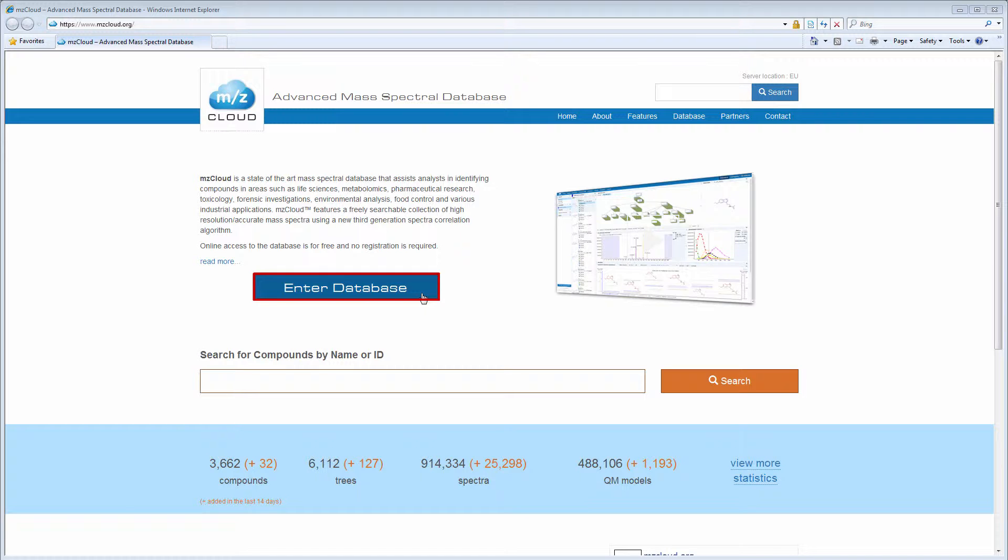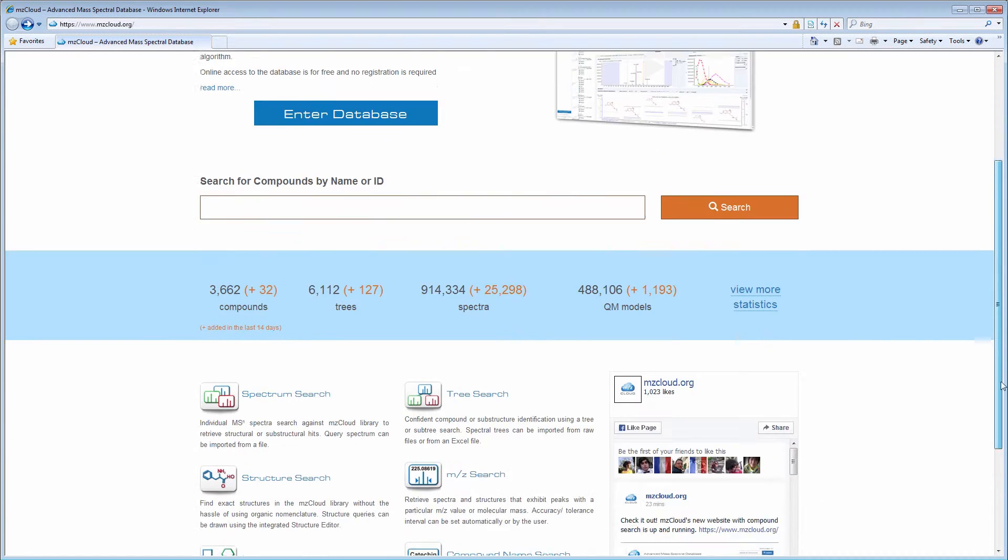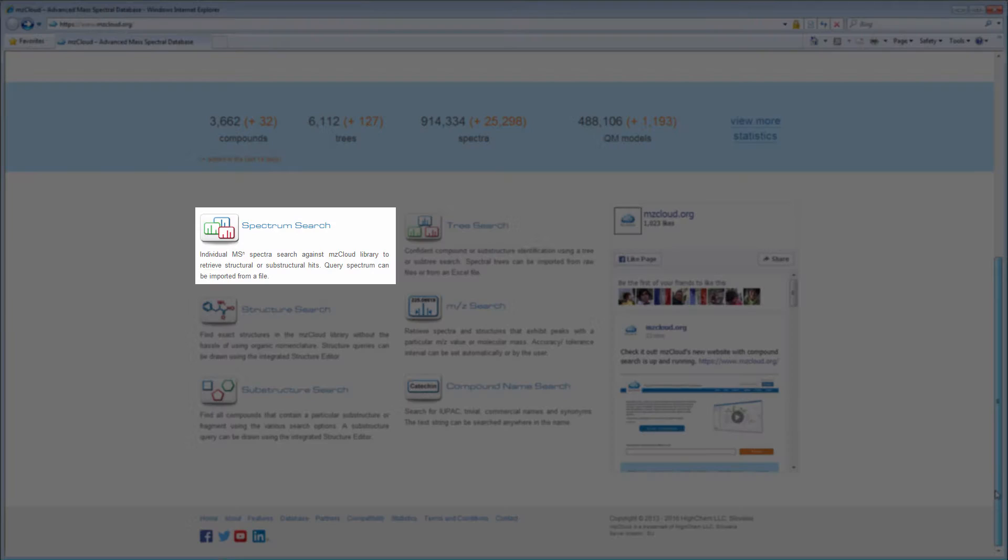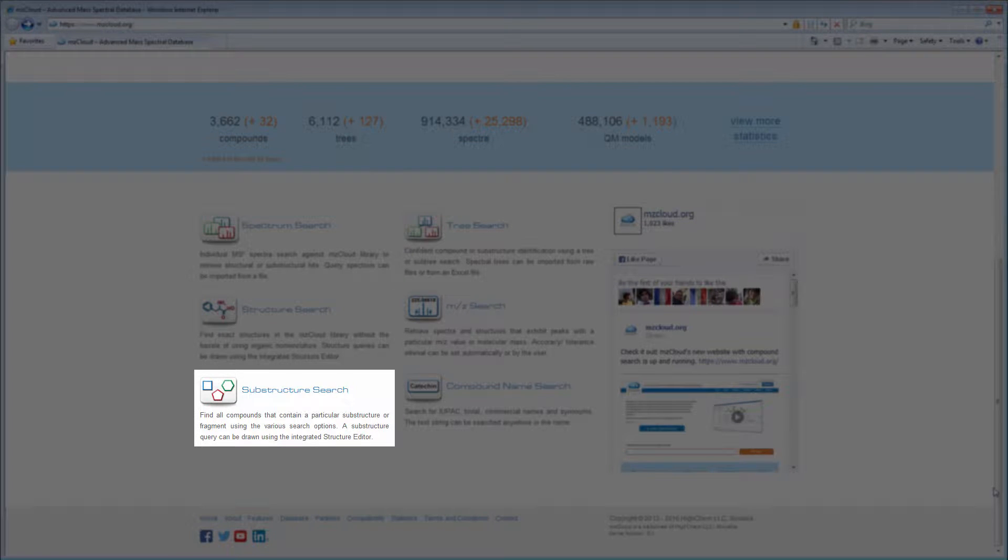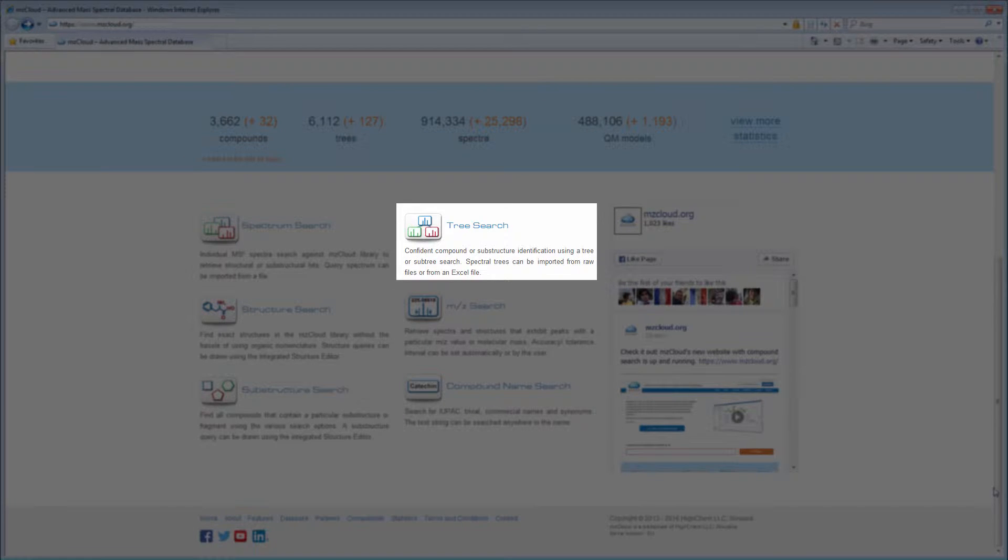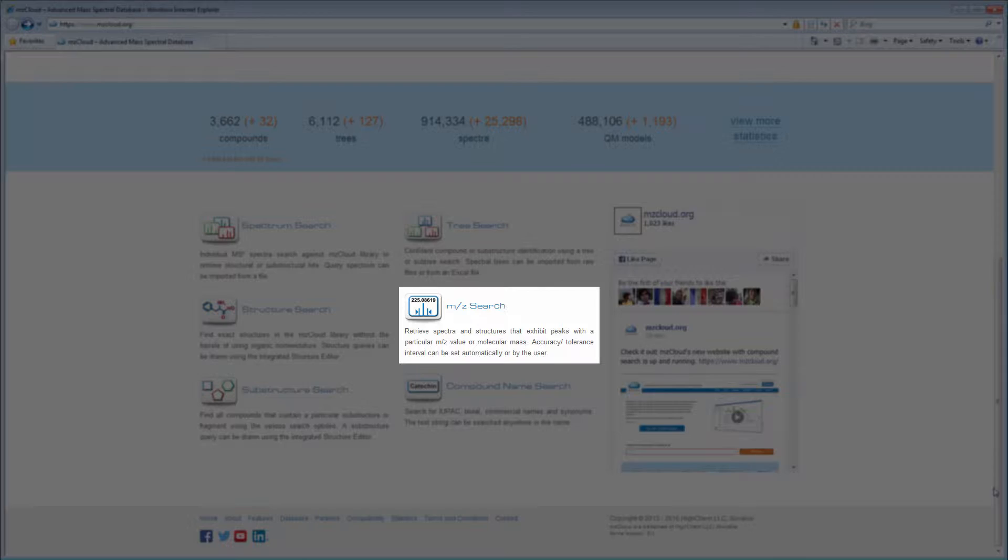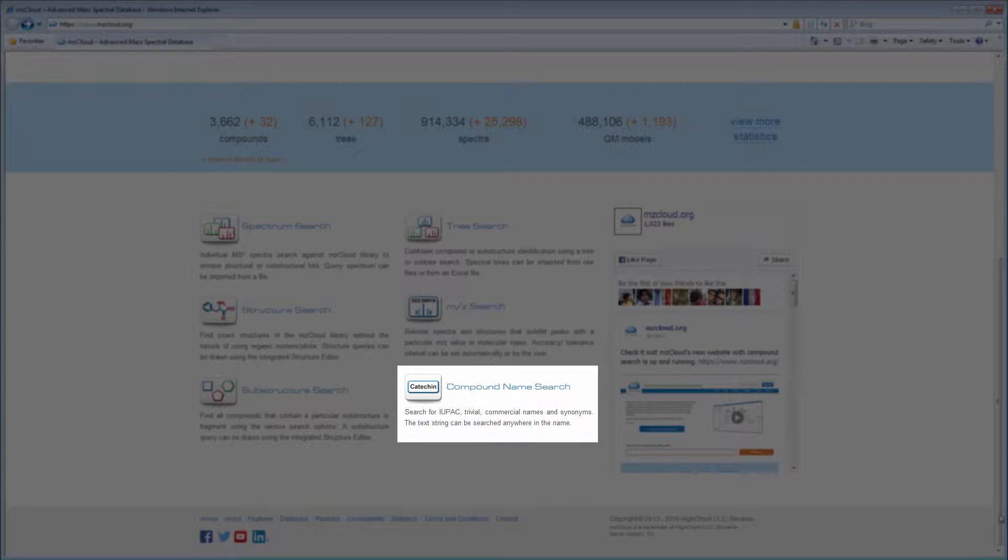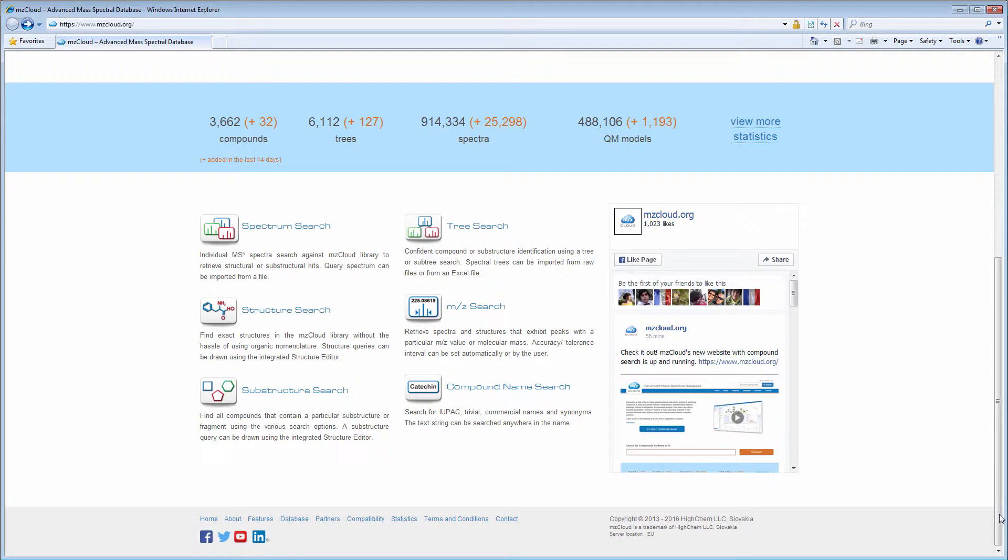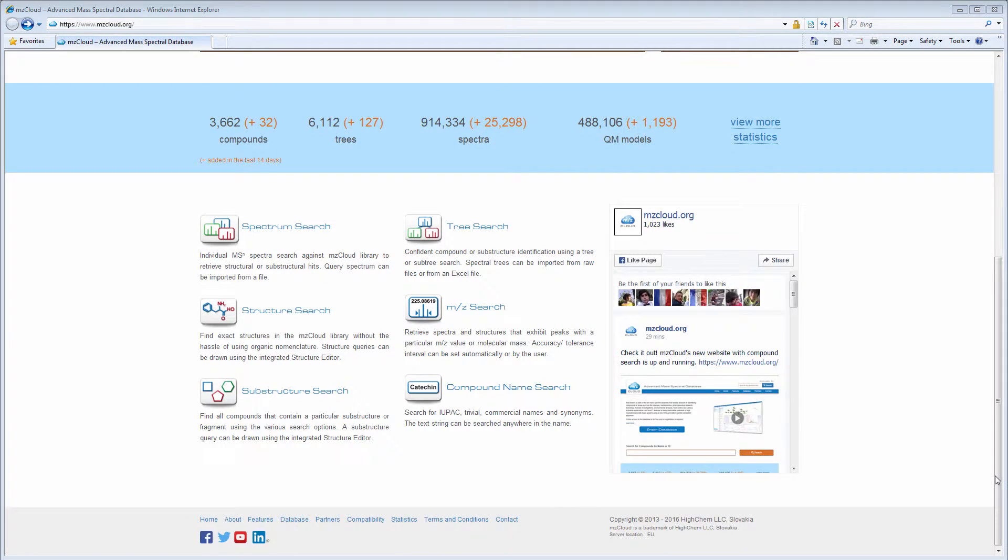To enter the database, you can click the Enter Database button, or you can select specific searches like Spectrum Search, Structure Search, Substructure Search, Tree Search, Peak or Precursor Search, or Name Search. We will cover some of the searches later in this video.